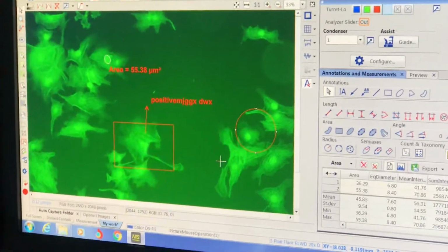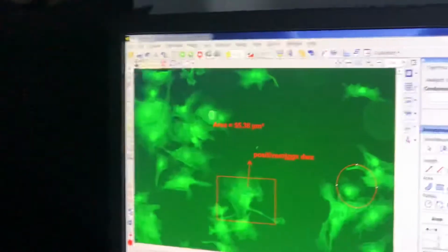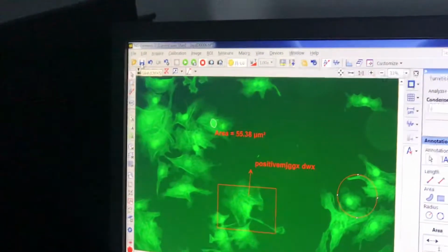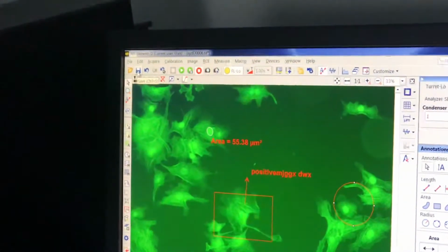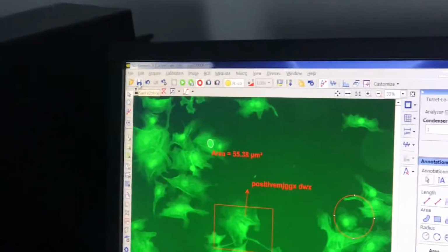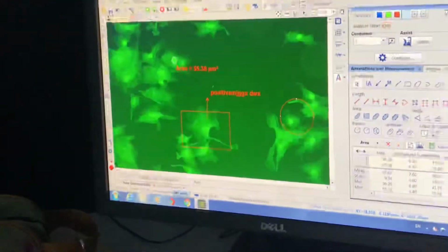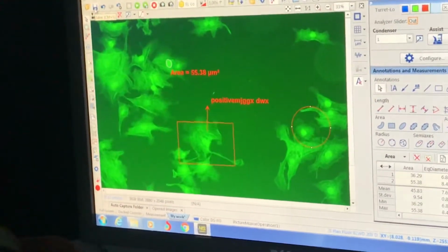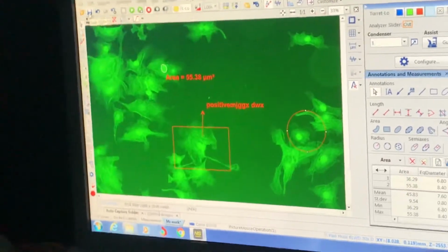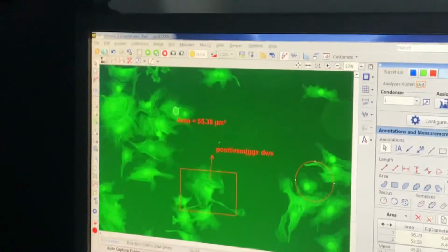I can do all these things and then I can simply press save, but if I simply press save, all this will be done on the original image. So it's better not to spoil the original image. Keep the original image, save the other ones as additional. But if I want to save directly to my file, just save. It's now saved on the file.